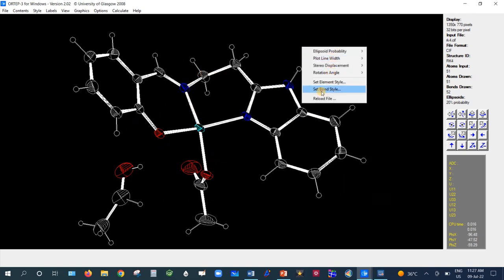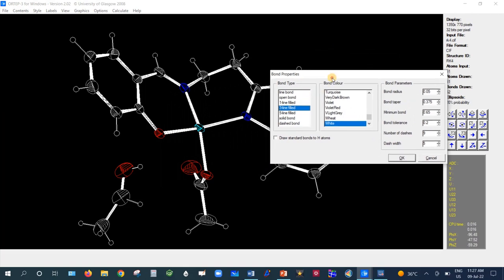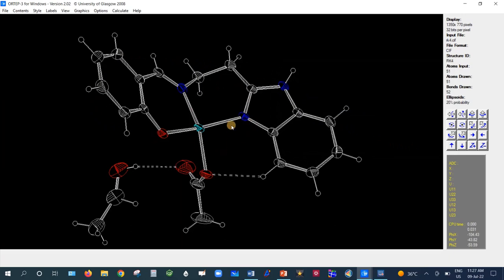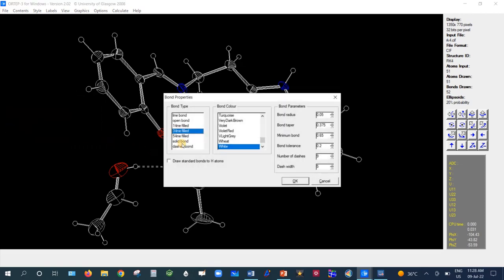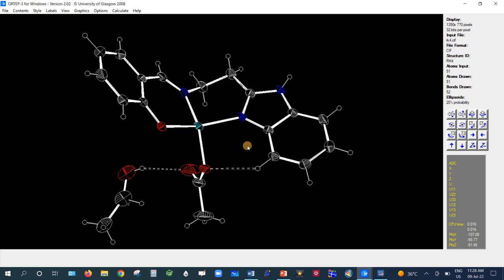You can also edit bond style further — for example, right-click and choose Set Bond Style, then select a style like three line filled and press OK. You can change to solid bond with a color of your choice (white, wheat, etc.) and adjust the bond radius if the bond appears too thick, as well as bond tolerance and number of dashes.